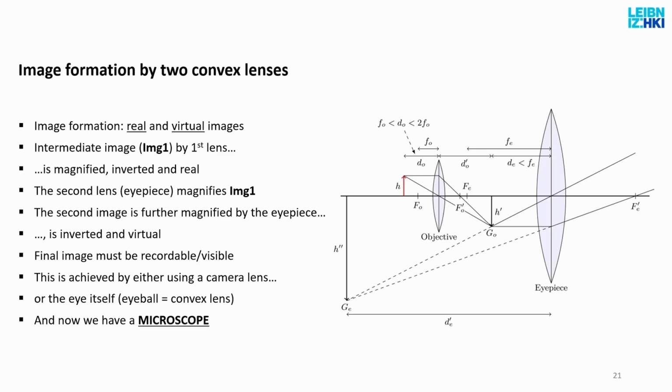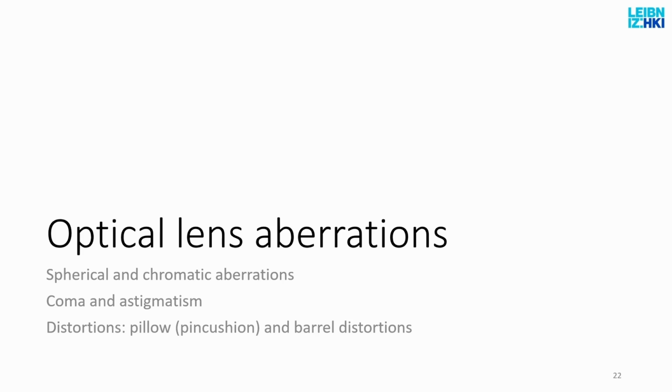It's like a car, the pistons are the heart of it. That's what produces the power. But you don't pay for the pistons, you pay for the whole thing that's built around to make it into a car. So with the microscope, you also don't pay for just the lenses, which cost you, I don't know, €10,000, but for the stuff that's around.